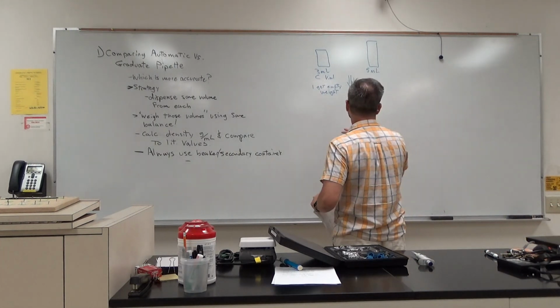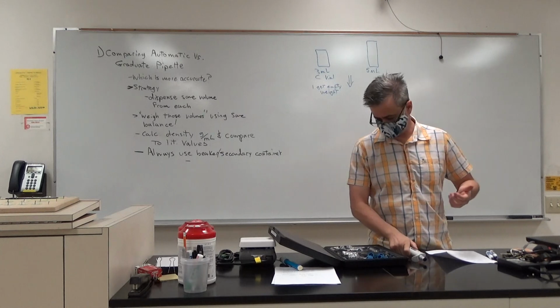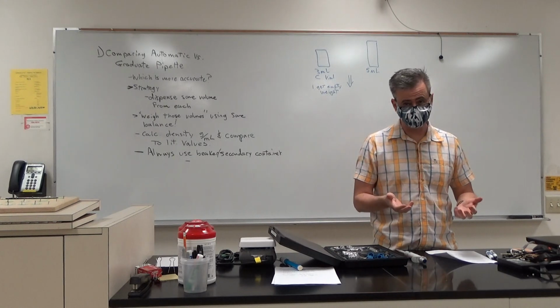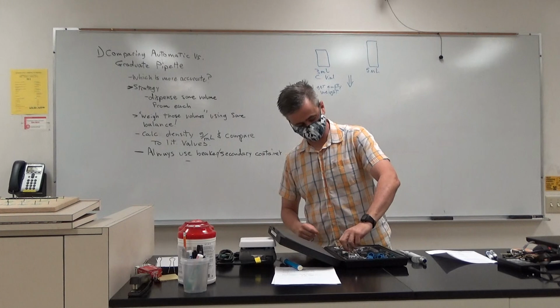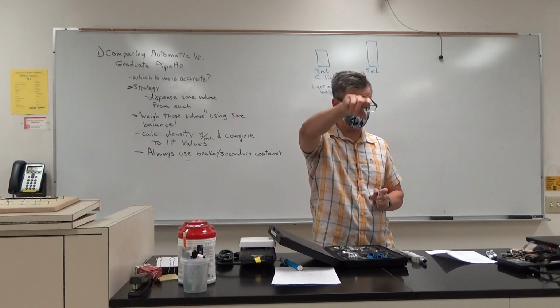And then what I would do is we'll do both pipettes. We've got the auto pipette and the graduated pipette. Do them both with hexane first. The reason I suggest you do hexane first is that hexane doesn't stick to glass very easily. After I'm done, I can pour it into the hexane waste, which is back there in hood 3 next to Aaron.